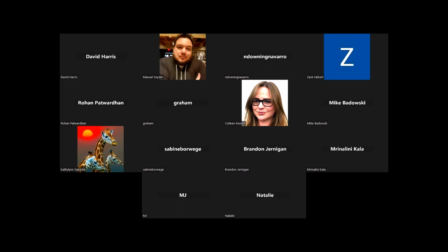and add things to a list. So they can see it and they can tell us what they want, but they actually really can't create a distribution list, as long as we have our permissions set properly for different users. Yes. But yeah, I think the catalog, once we go through the catalog stuff, that'll address this, because that's what that's for, for creating requests from a query of your samples that's de-identified and stuff.